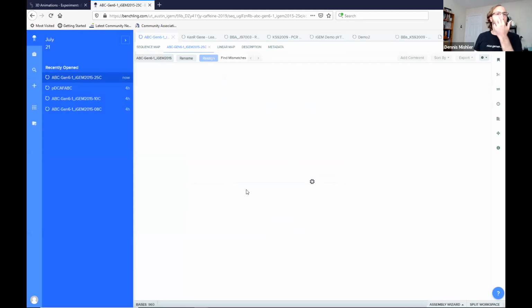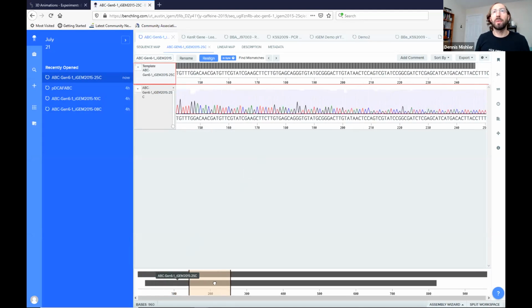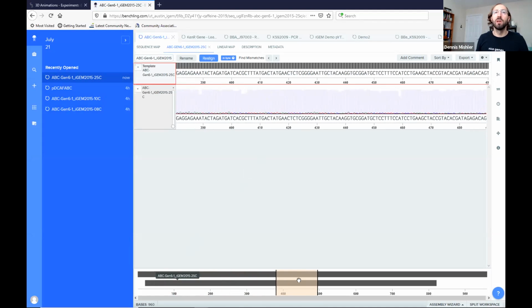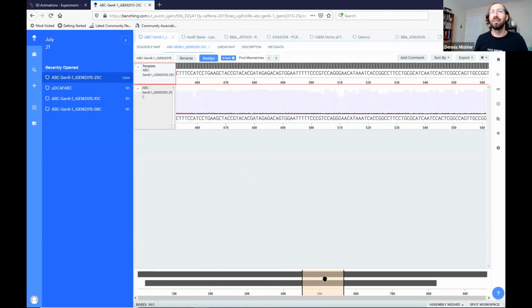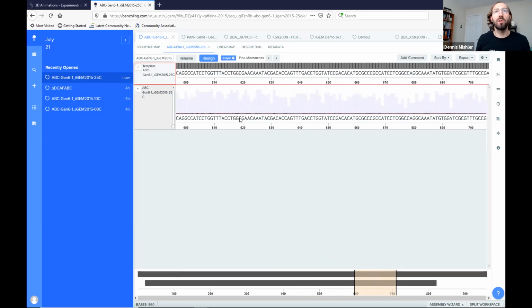Okay, great. So what we're going to see here is just the chromatogram and the DNA sequence predicted. The top is the DNA sequence predicted, and this is the chromatogram down here. As we go along, the peaks get smaller, and that's because of the chain terminators. As you go further into the reaction, less DNA sequence is full length or going further, right? Every time you terminate, you lose one product, right? And so at some point, it gets so low you can't really see it.